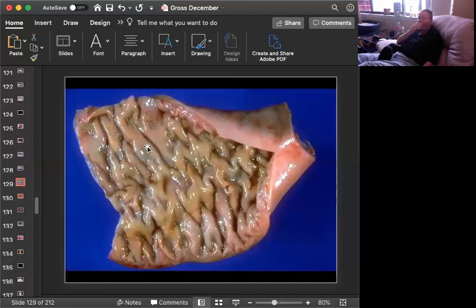Okay, we're moving on to slide number 5. Oh, we're back to horse. There's tissue from a foal. Can you give me the morphologic diagnosis, a cause, and associated clinical pathologic lesion?